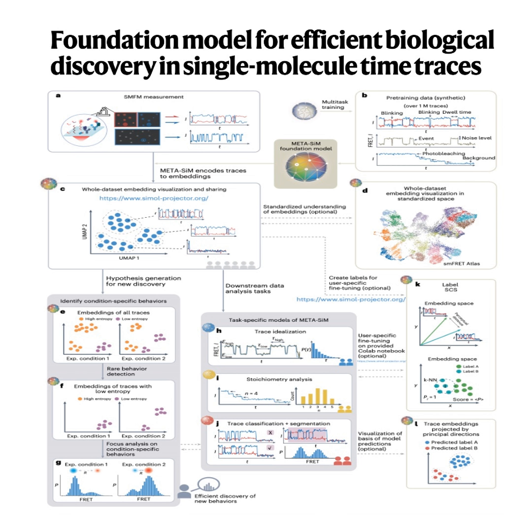So the rare events were salt-dependent. Exactly. The LSE analysis revealed this subtle shift from a low FRET state being prominent among the rare events at low salt to a high FRET state being prominent among the rare events at high salt. It was a kinetic change specifically highlighted by LSE that was completely buried in the overall population average.